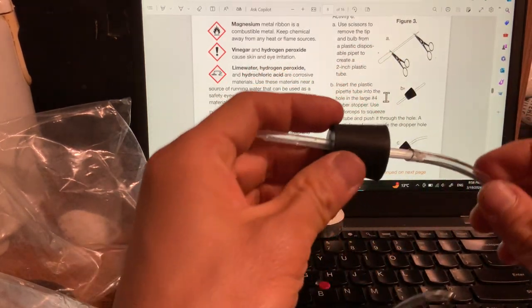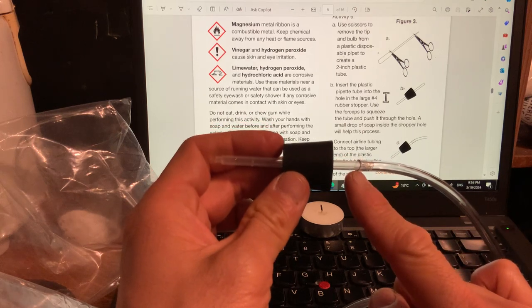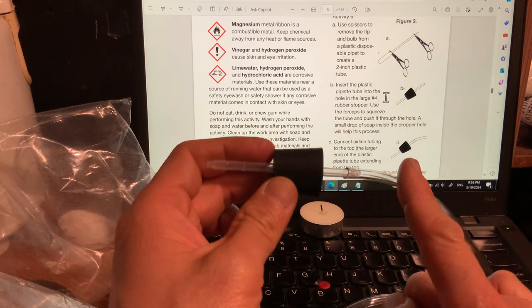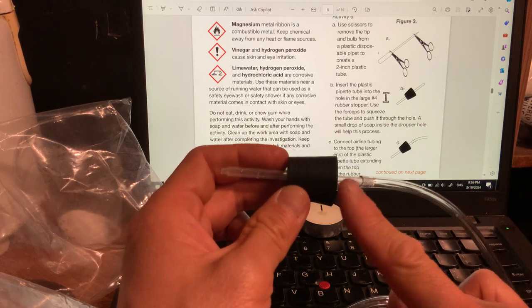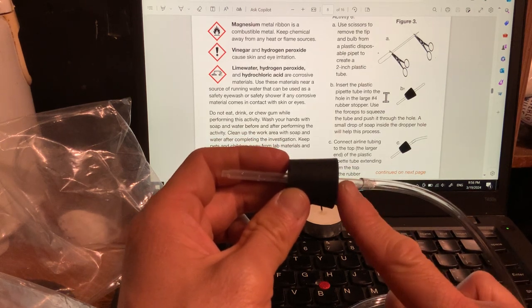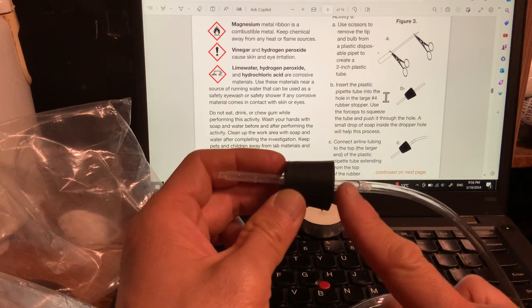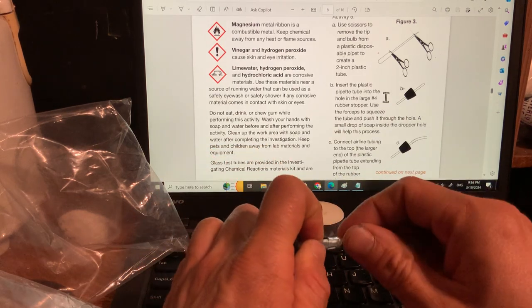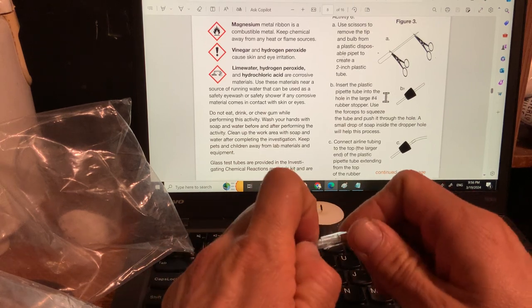Okay, so I had to squeeze the pipette. So do not squeeze the tube. Squeeze the pipette. This plastic is thinner than the tube. So you got to squeeze this. Squeeze on that. You can wrinkle it. You can damage it just to force the tube on.